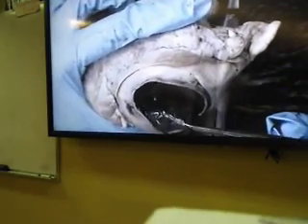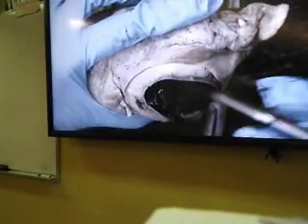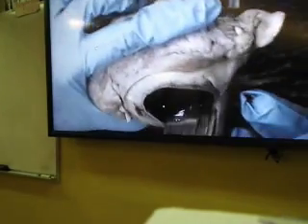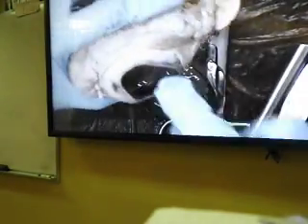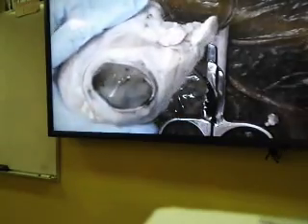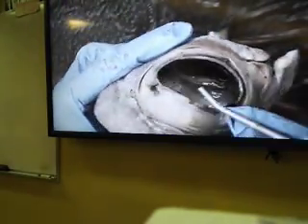The whole point of the dissection is to be able to see everything without destroying much. So here is the vitreous humor, it just fell down. Okay. So a little bit left here. Okay. So first thing, before I even see the choroid coat, I have to see the retina.